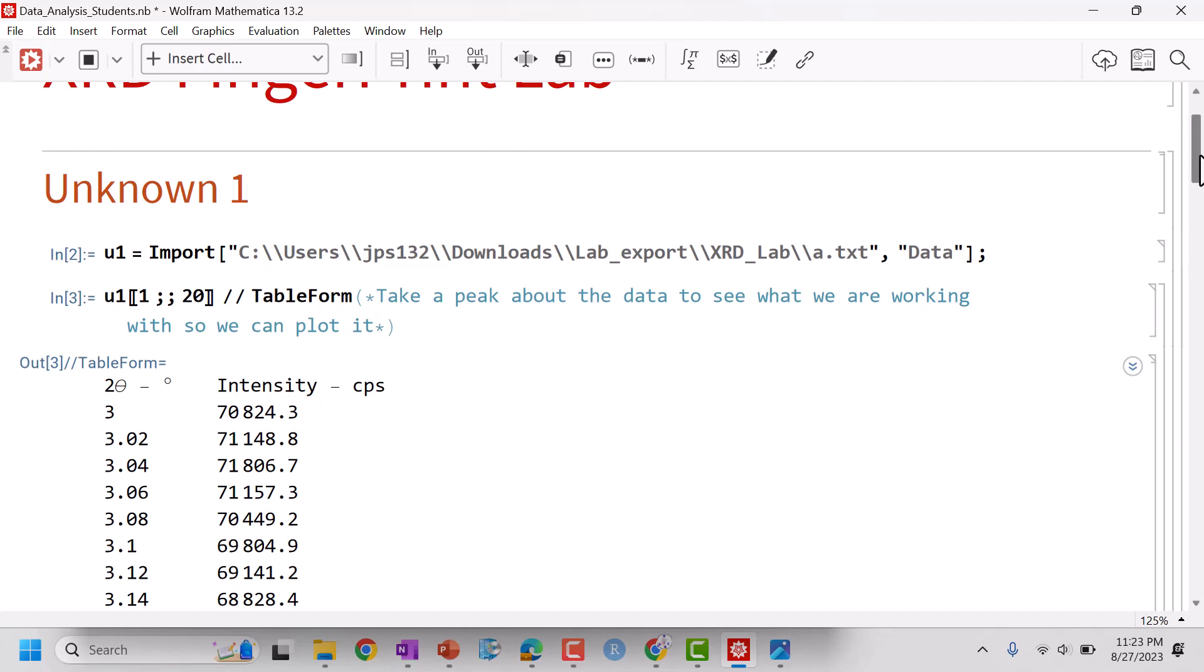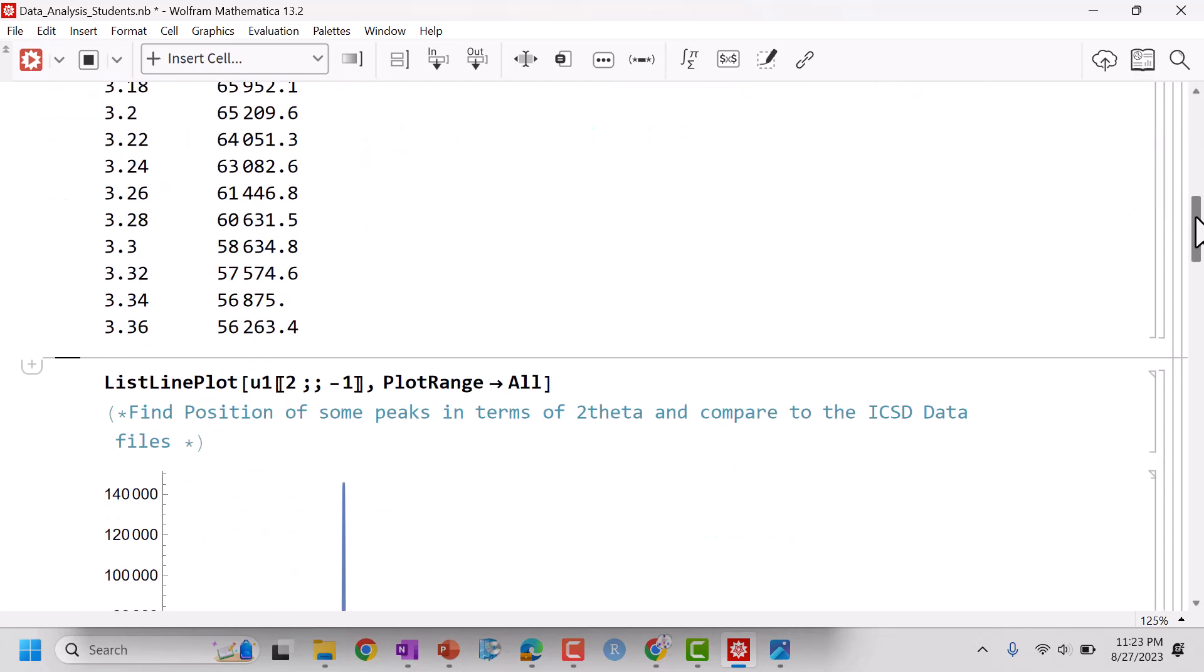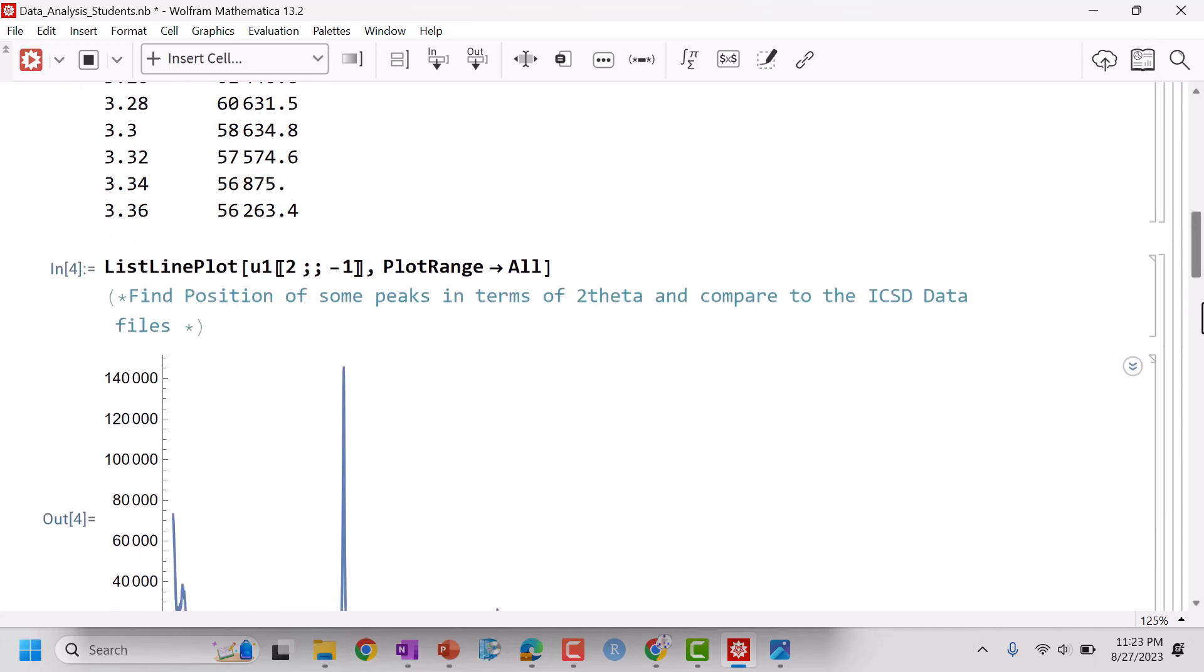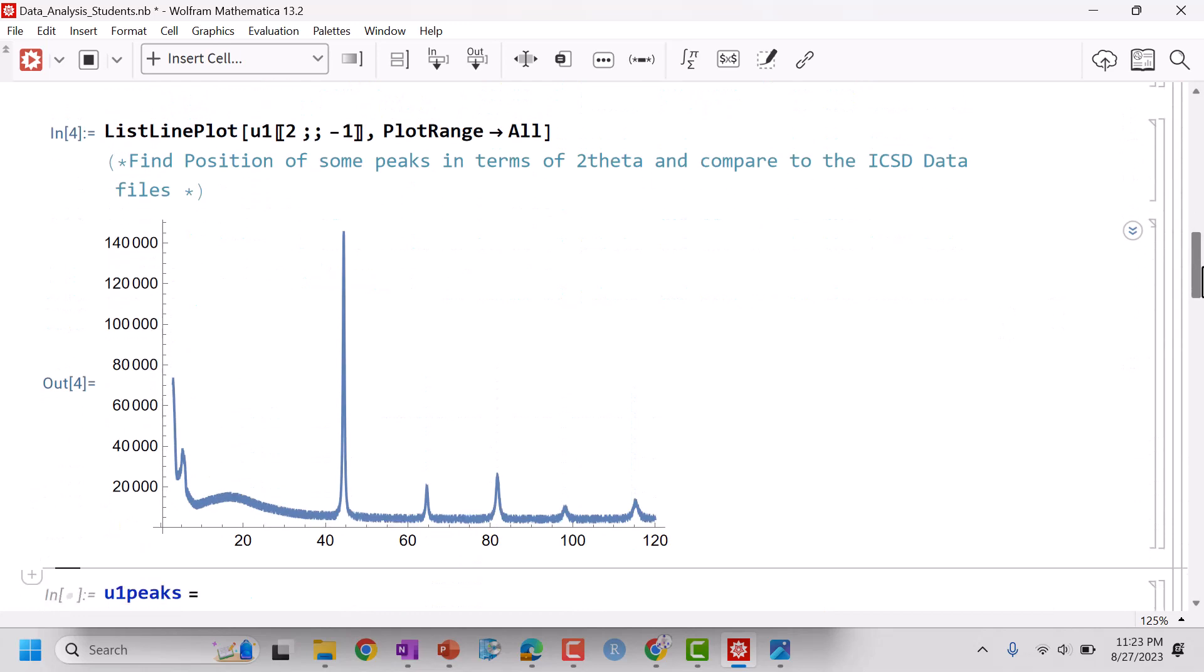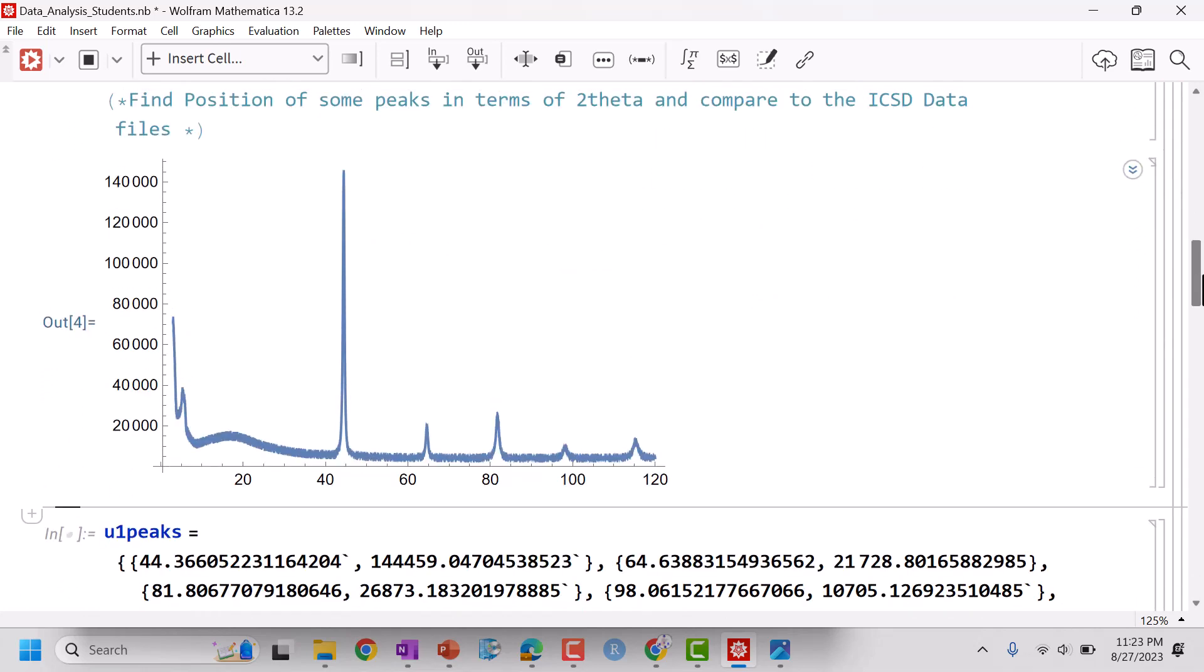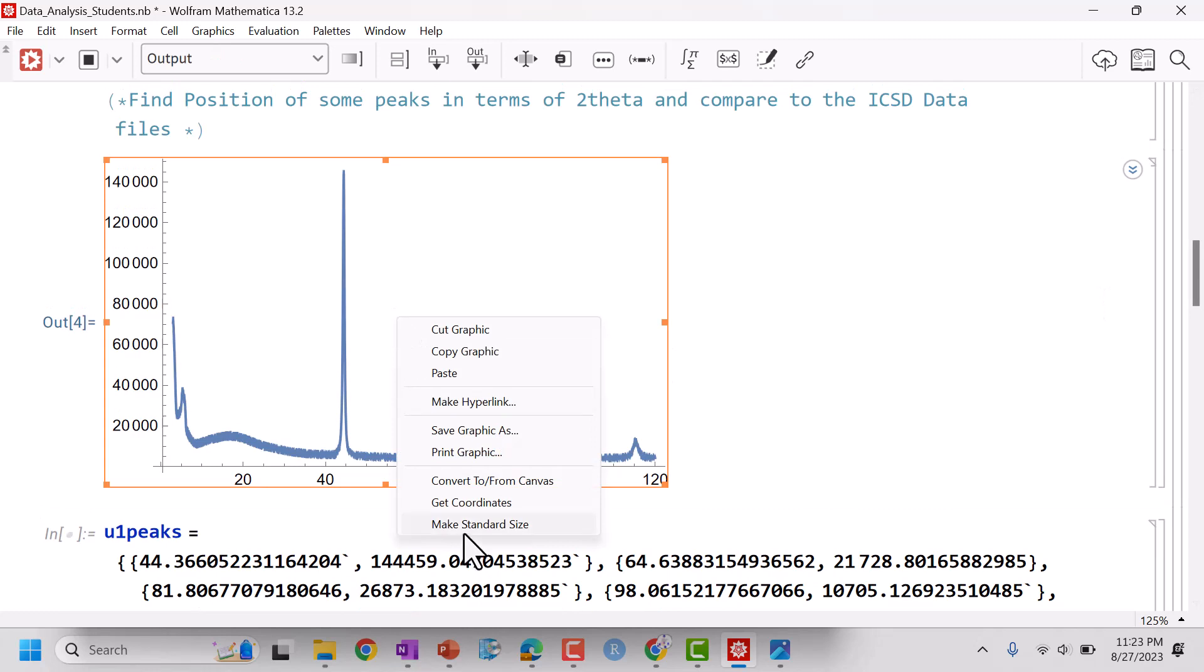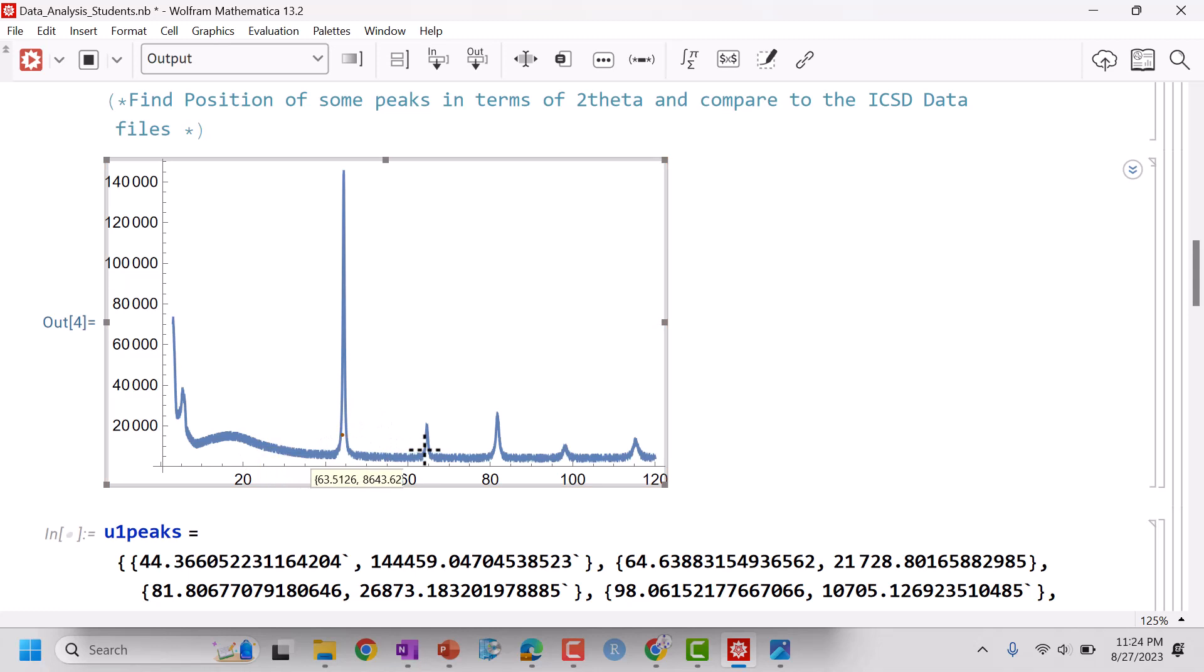It's always good to do this. You kind of see where we want to extract the data from. I see that I have angle versus intensity so I probably want to start out at the second row and extract everything here. I can extract from that second row down and I can see my plot, which is nice. One thing I can do right now is I can start to right-click and get coordinates.